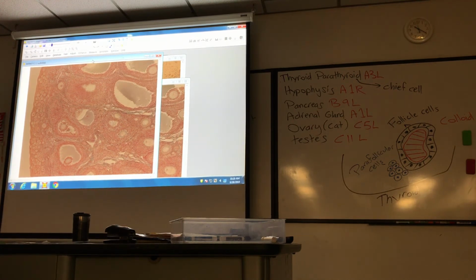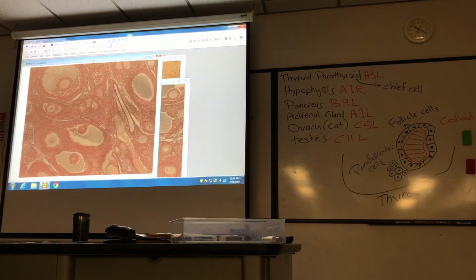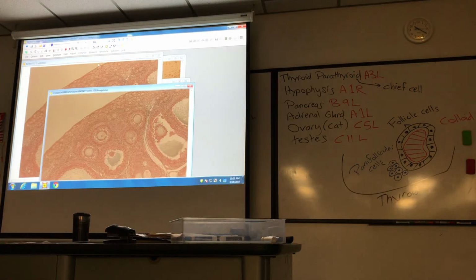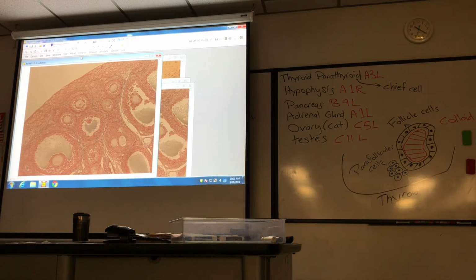Look around, look around. Oh, these are good secondary. Okay, so I see 4 secondary right here. This thing right there, boom, boom, boom, boom. Those are all secondary. Now, if you zoom in right there, maybe we can see the theca and granulosa cells.